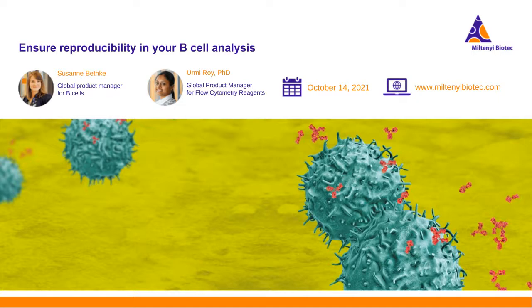We also have some protocols around. We have some application examples, of course, for the COVID topic, where we tested this with SARS-CoV-2 spike protein. So if you're interested in that, you could also check out these protocols and application notes that we have available there.